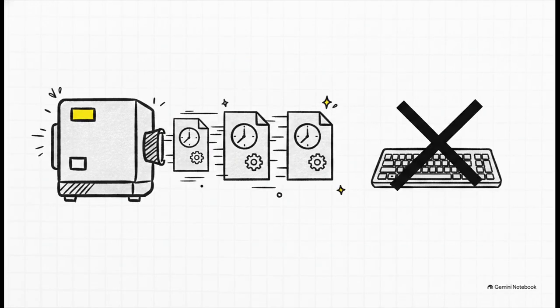So if your sample names are super similar, you only have to make a tiny edit instead of retyping the whole shebang. On the flip side, maybe you don't really need highly specific names. If you're just doing a quick sample screening and don't plan on reusing the raw spectra down the road, change your batch naming mode to automatic. The app instantly tags every batch or scan with a timestamp and your spectrometer's serial number. It is unbelievably fast and requires zero typing.